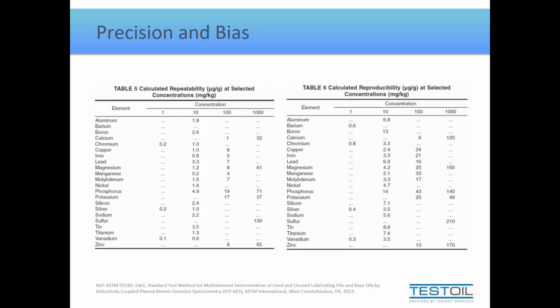But a lot of people will take that small increase at a low level and think of it as significant because, as an example, 1 going to 3 is a 200% increase. But 101 going to 103 is only a 2% increase. Yet in both cases, it took the exact same amount of material to achieve that value.